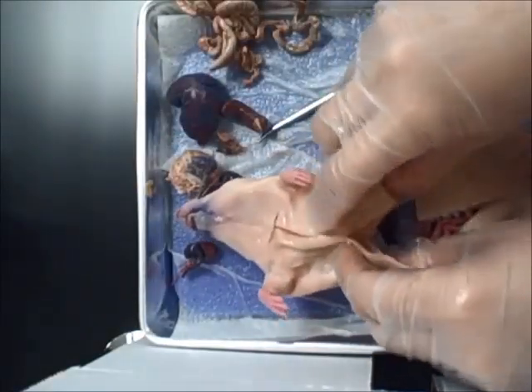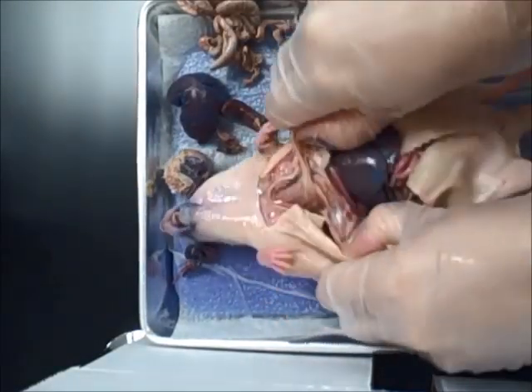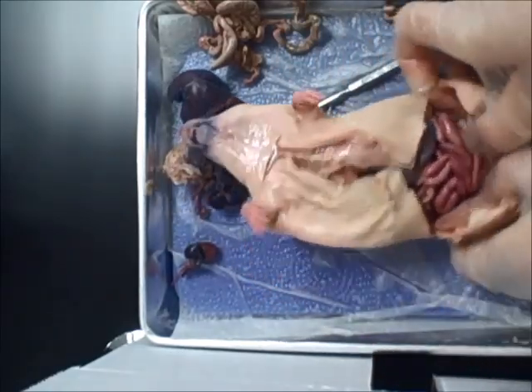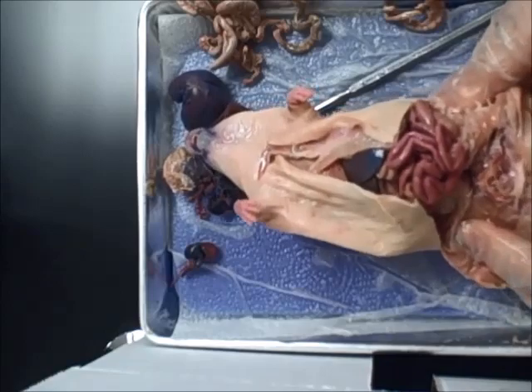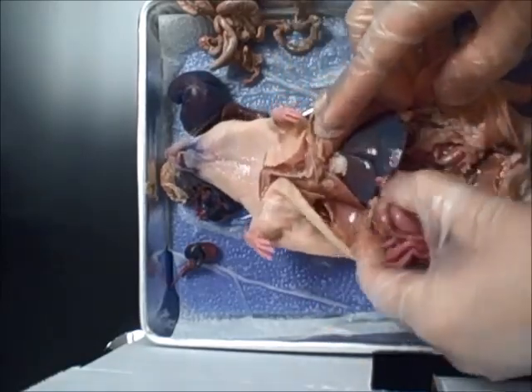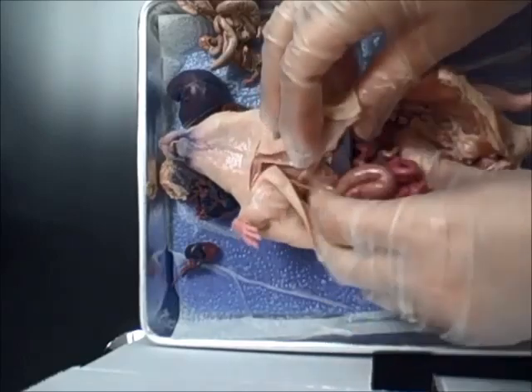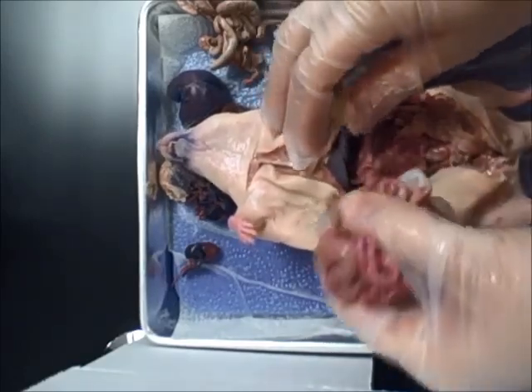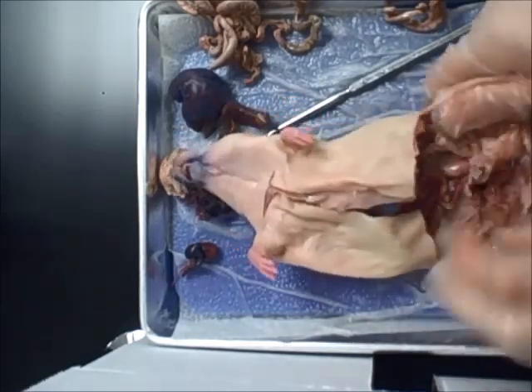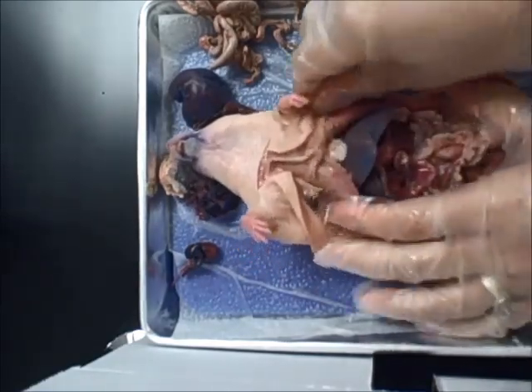All right, now the female rat has a different shaped uterus than humans. The female rat has a horned uterus. Let me remove the intestines so you can see that better. The uterus on the female rat is horned.